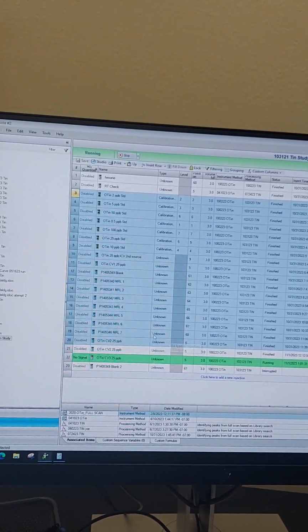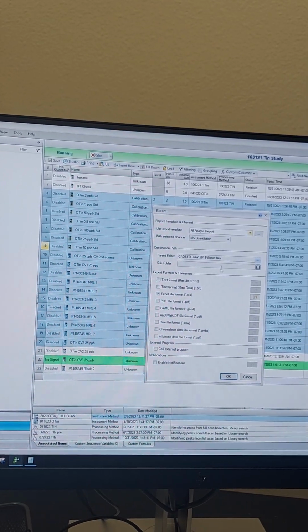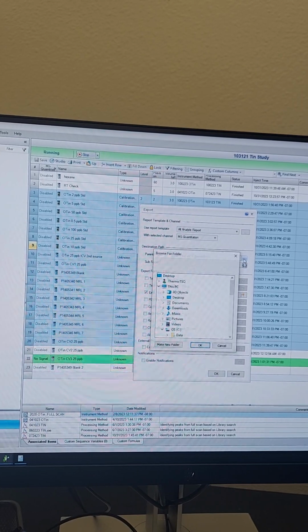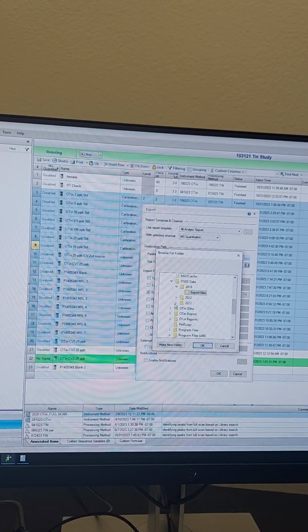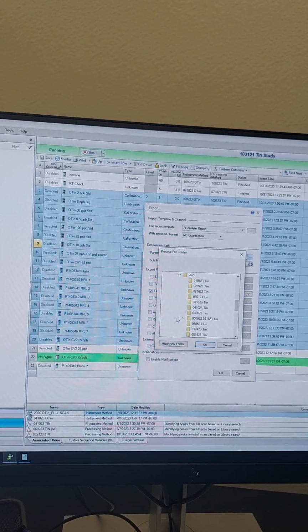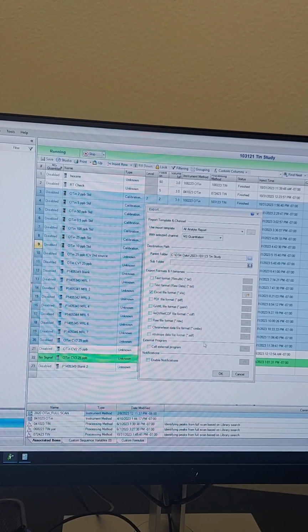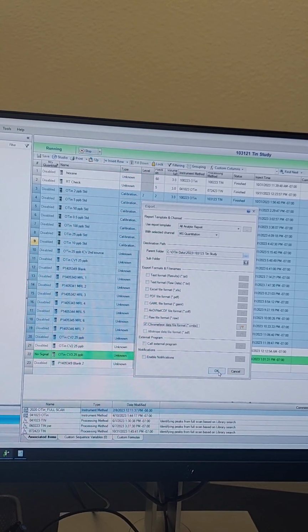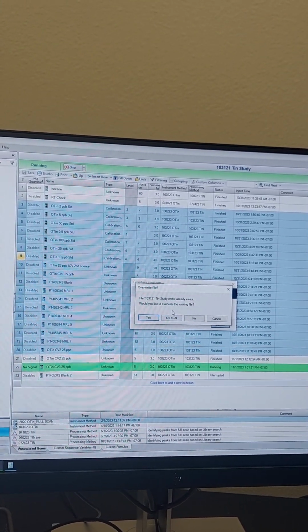So let's select everything in the batch. Export. All analytes, MS quantitation. Where are we at? What's in data 2023? And then let's not do that and do this. Chromeleon. Already X6, yes.